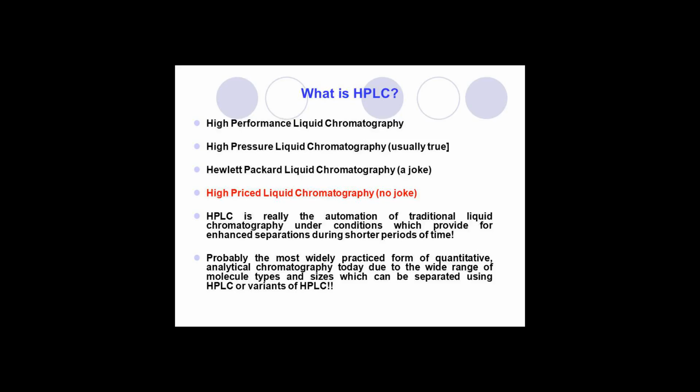The interaction strength depends on the functional groups that are part of the analyte molecular structure, with more polarized groups, e.g., hydroxyl, and groups capable of hydrogen bonding inducing more retention. Coulombic, electrostatic interactions can also increase retention. Use of more polar solvents in the mobile phase will decrease the retention time of the analytes, whereas more hydrophobic solvents tend to increase retention times.